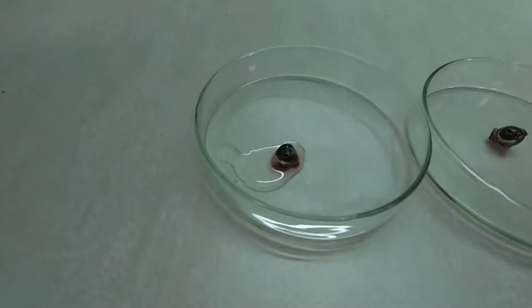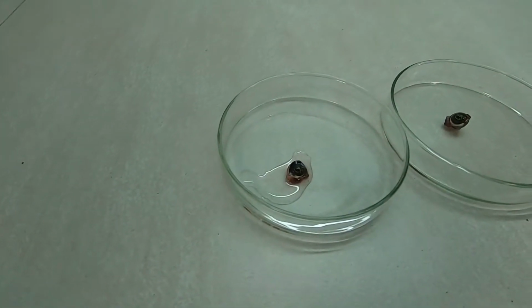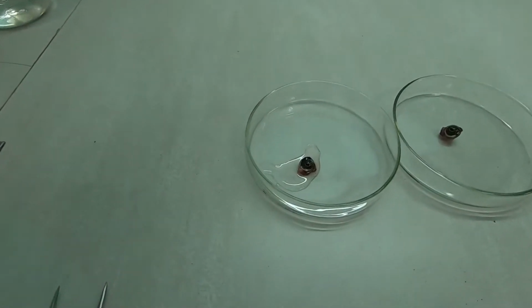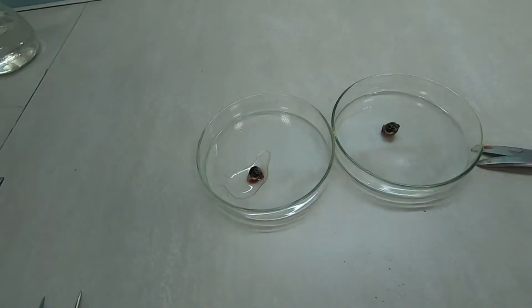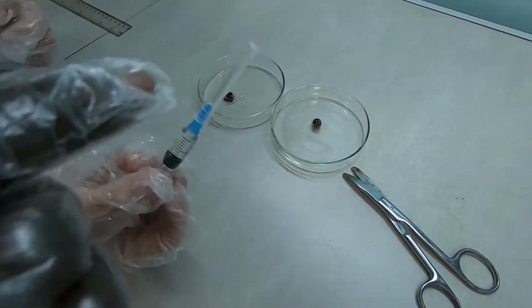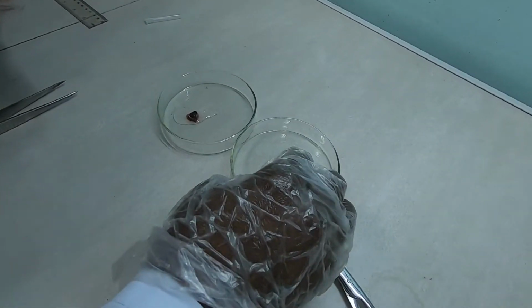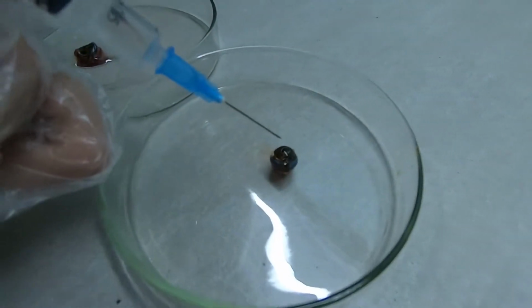Okay, now let's take our adrenaline. Put some drops here, just a few.